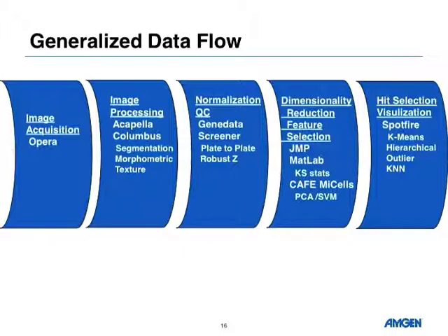And then going to hit visualization: after we've done all this number crunching, how do you actually visualize the different hits that you have, and how do you figure out ways to classify these in a meaningful way.